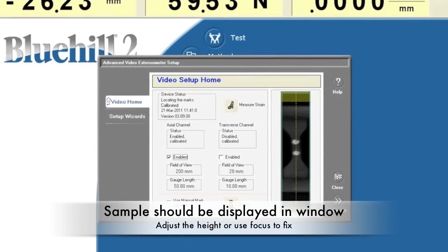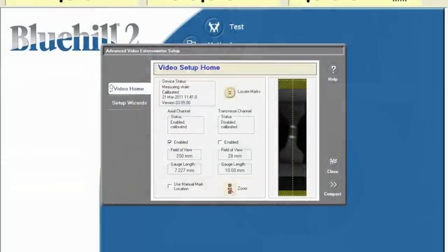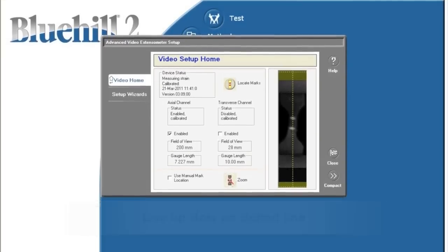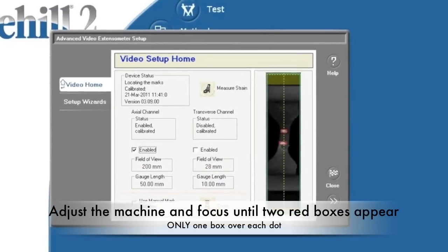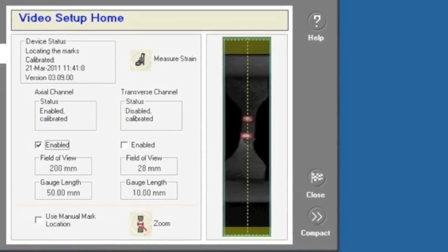Make sure the sample is displayed in the black window. Move the video extensometer and use the focus inside the box to adjust and focus the sample view. Line up the white dots on the middle dotted line. Two red boxes should appear, one over each of the dots. If multiple red boxes appear, try to refocus the video or redo the dots.